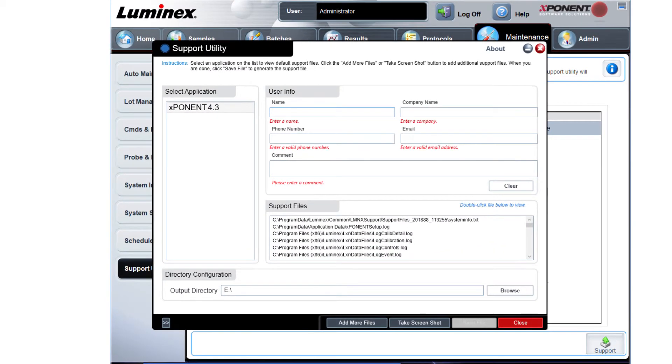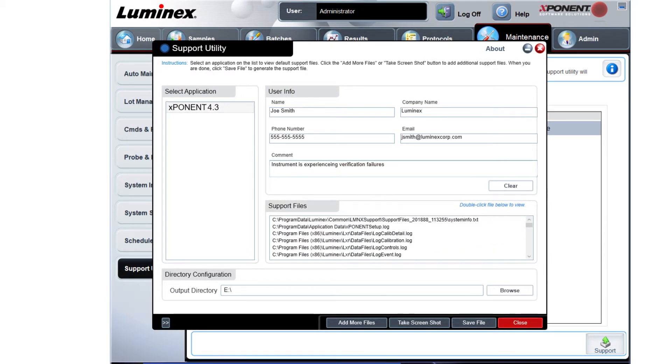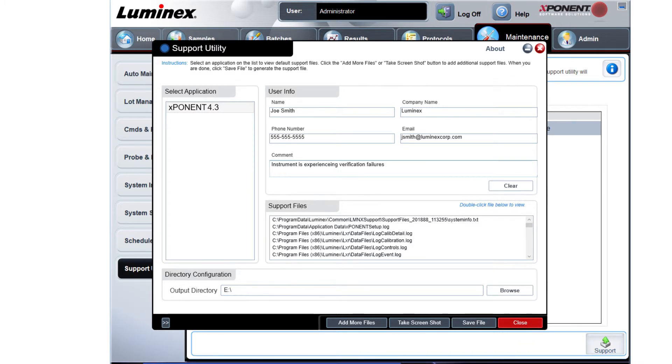Fill out the required fields. In the comment box, type a detailed description about the error the instrument is experiencing. Verify the file storage location. Click Save File.